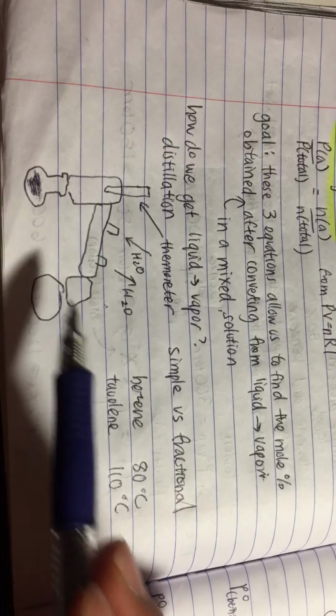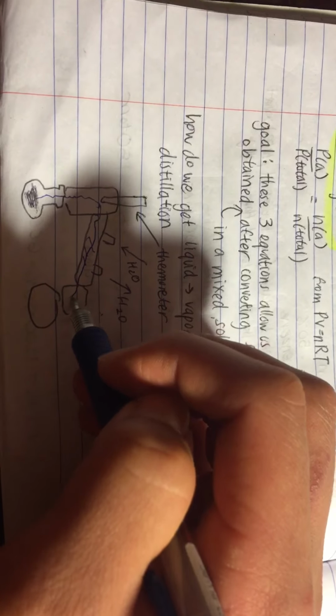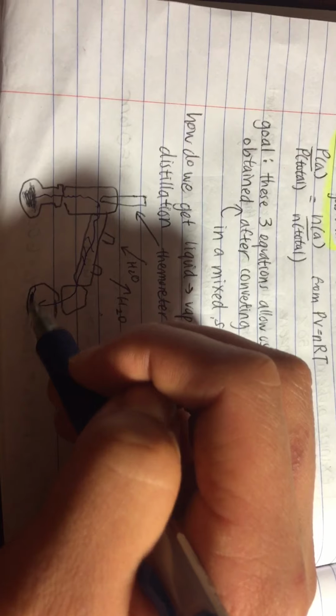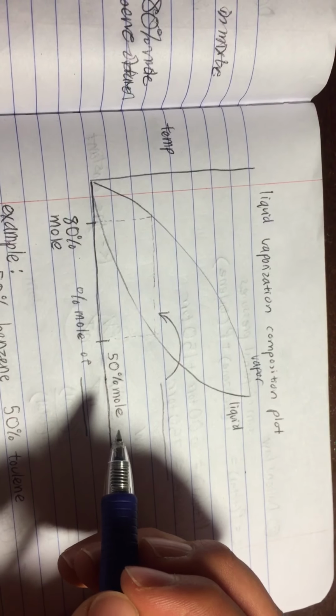So you're going to boil the mixture in this flask, and what you want, theoretically, is the benzene to go up due to vaporization. And what happens is, because cold water is being put here, the vapor is going to condense, so it's going to turn into liquid, and it's going to go down into here, and this is the distillation flask. So in theory we could get two different separations, and we could see that here in a liquid vapor composition plot.